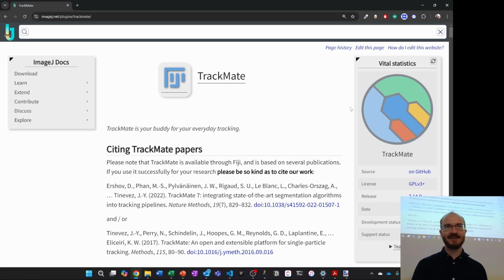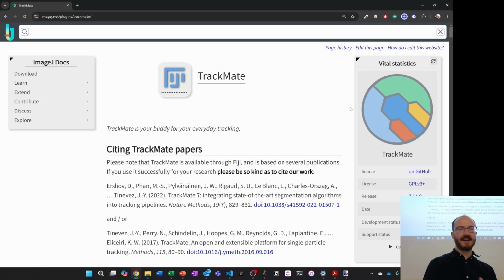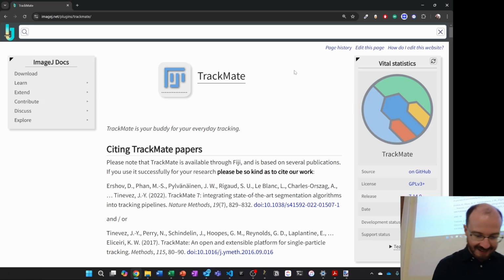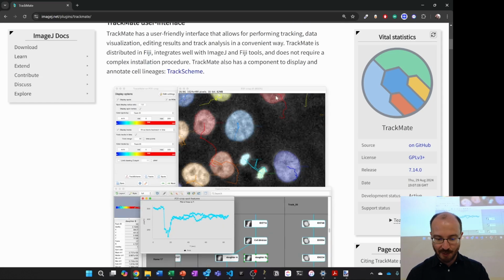So we're now heading into the part of the talk which is talking about time-lapse sequences. So how do we track things over time? How do we track movement over time? How do we, I don't know, understand time dynamics in our samples? And now one of the cool tools that Fiji has brought in is called TrackMate. So again, I'm not going to show this to you, but just at least be aware that it exists.